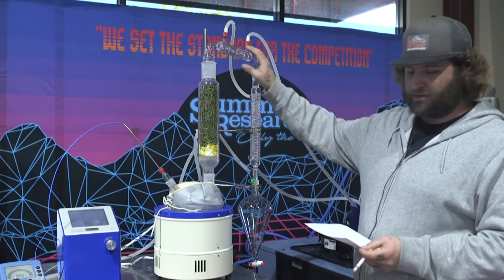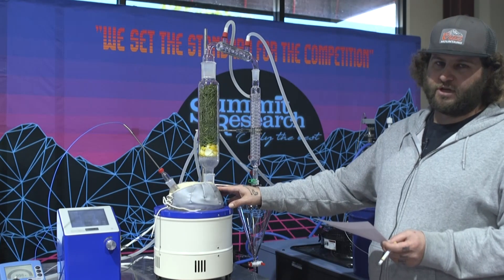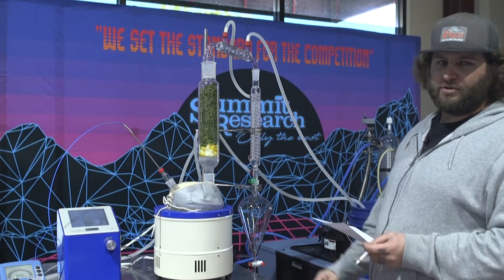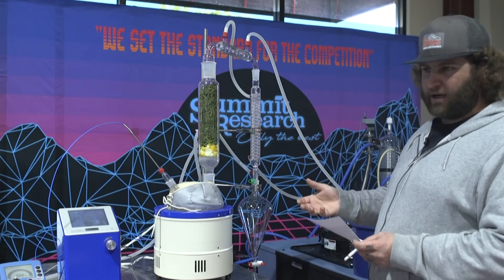The idea is you want to go as low as possible, so bring the temperature down. You can use a mixture of different liquids — whether it be water or a mixture of solvents — it just depends on how you're doing the distillation. I've heard some people use ether to pull aromatics out because ether separates really well and it comes off much sooner.